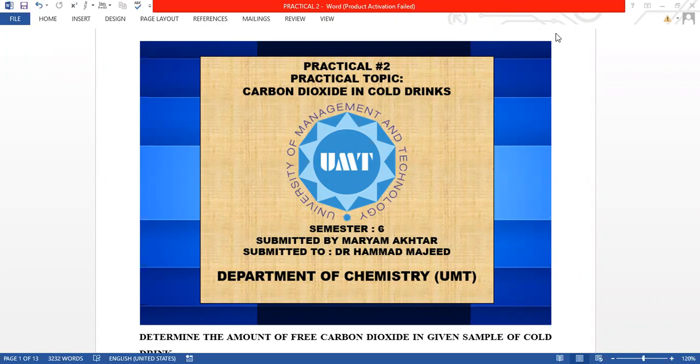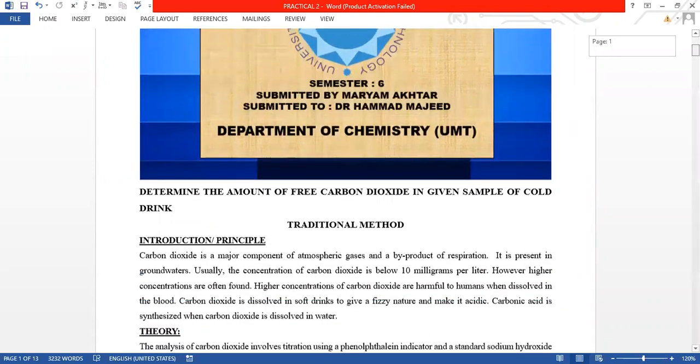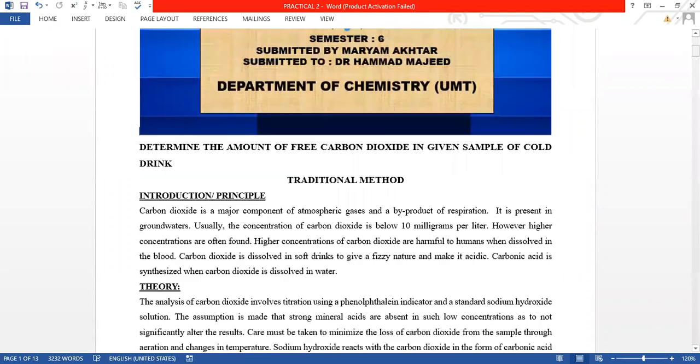The topic of this practical is the percentage of carbon dioxide in cold drinks. First, I'm going to talk about the traditional method for the calculation of the carbon dioxide present in soft drinks or cold drinks. Then I'm going to talk about the very advanced method.